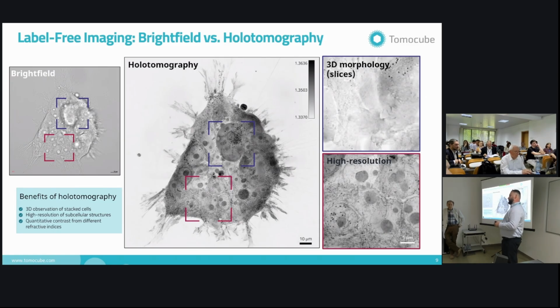Really? Because what we do here, we don't calibrate based on the medium as you do in the first generation holotomography or the classical QPI. We measure everything in the volume as it is. So if the light scatters a lot from here, that means this object here is really dense when the next slice is below. So that's what we do, Z step through. We do overlapping in Z itself as well. And each pattern apparently is supposed to have some specific information of the light being scattered. That's the way I would describe it. I didn't go into the physics of it too much myself.